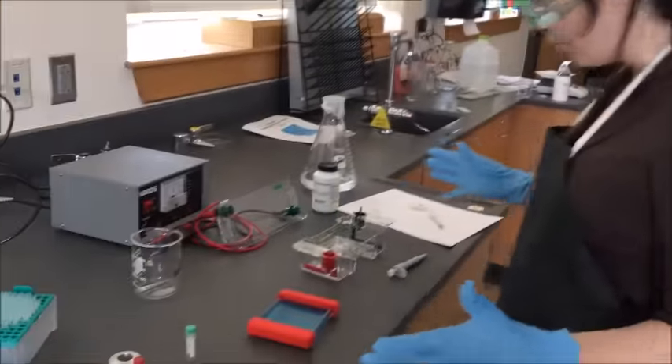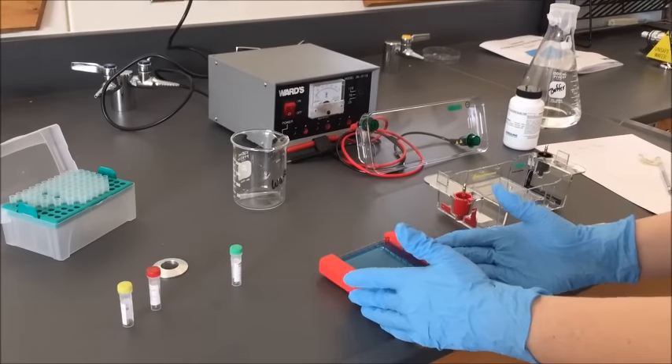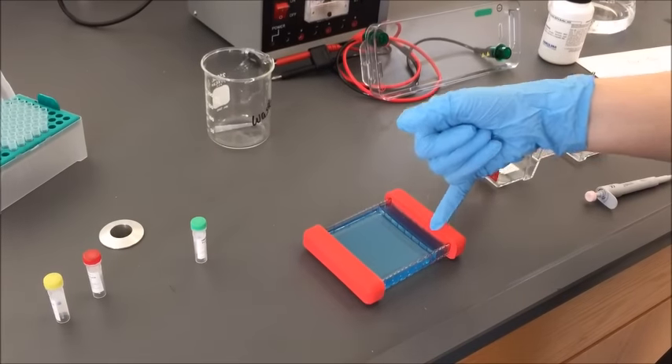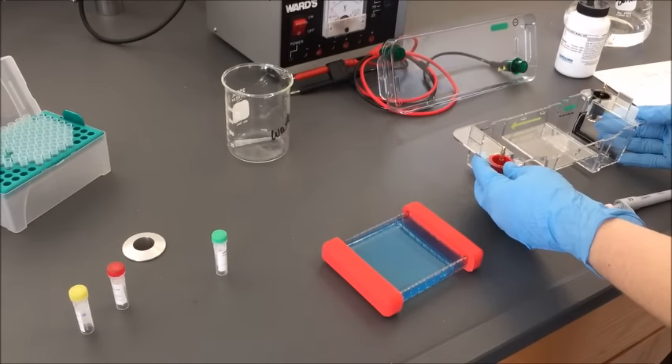You have a few pieces of equipment out in front of you. The first thing that you're going to need to work with is your gel, which is right here. Your teachers have already made this for you and it's set. These little indents right here that we're looking at, those are your wells. Now this needs to go into your chamber, which is this structure over here.